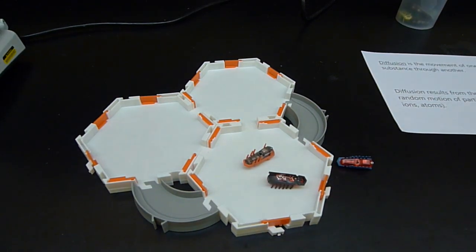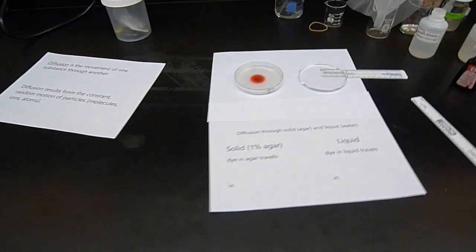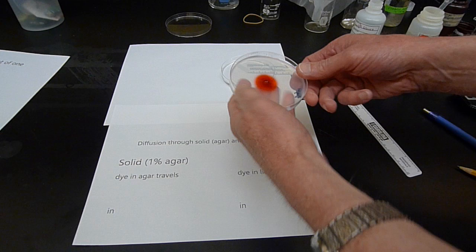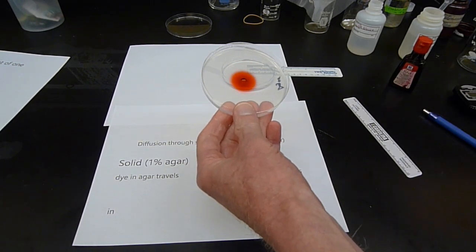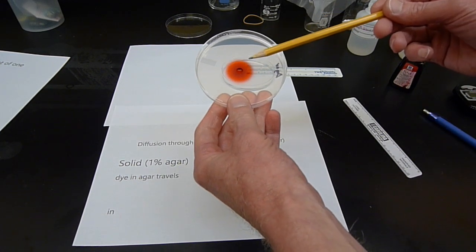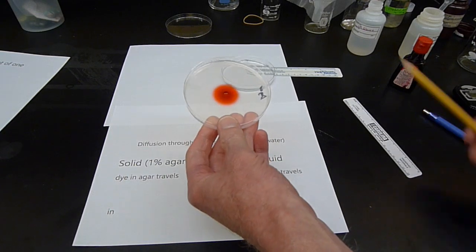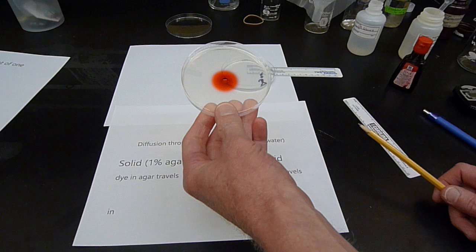So to get to one of the exercises from the manual, here I have two Petri dishes set up. This is a Petri dish with some agar in it. Agar is a kind of starch that's derived from algae, and when you boil it up in water, it forms this kind of semi-solid material. And in this hole, I've placed some dye. I inoculated the dye in there early this morning, so it's been sitting there for about 5 hours now, and it's diffused. You can see the dye just sort of spreading out through the agar, the semi-solid material.